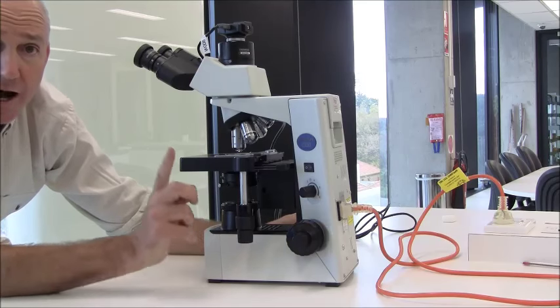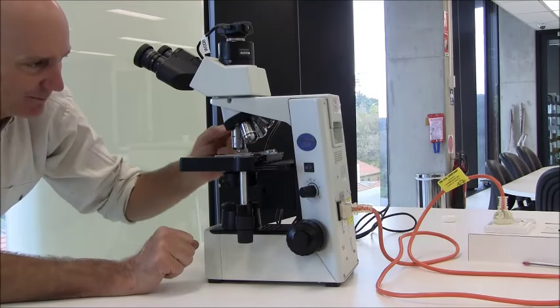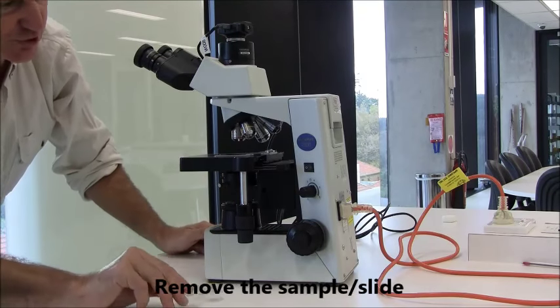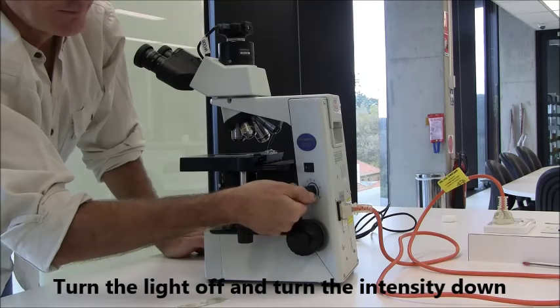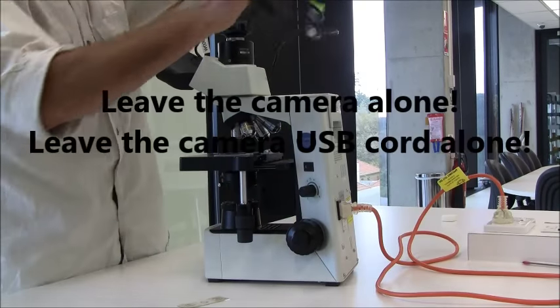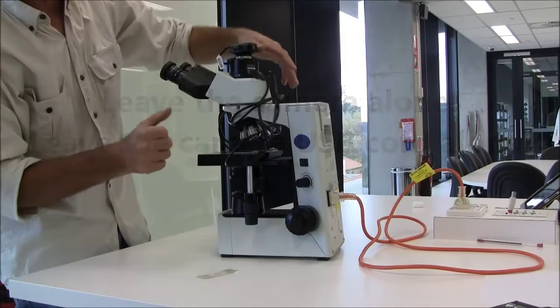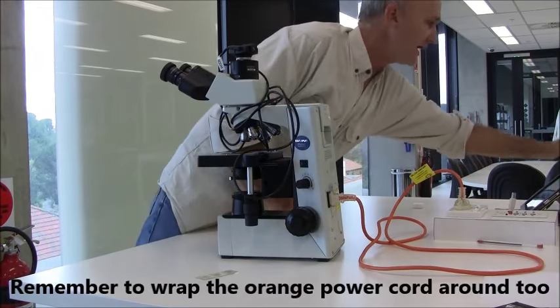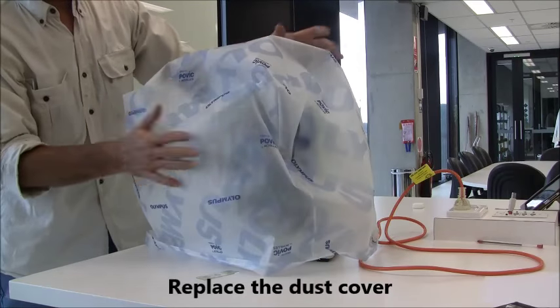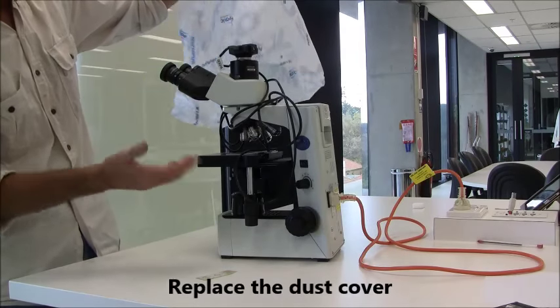Now, putting this away — the pack-up procedure is to return it to its lowest magnification, always remove the slide, turn off the light source, put it onto its lowest light intensity, and just loosely wrap the cords around — they don't have to be tight or very neat. And of course, pop back on a dust cover. Most students appreciate getting a microscope out and finding it in that condition.